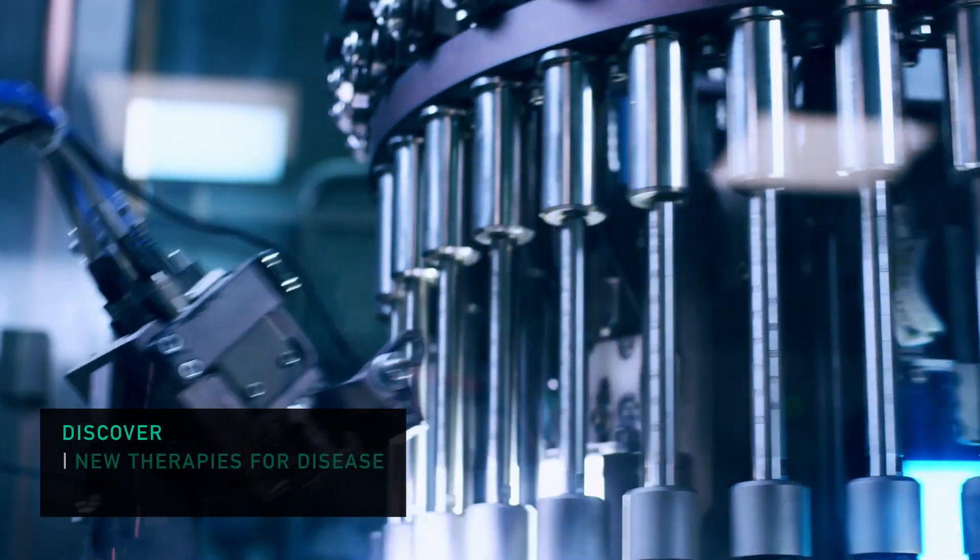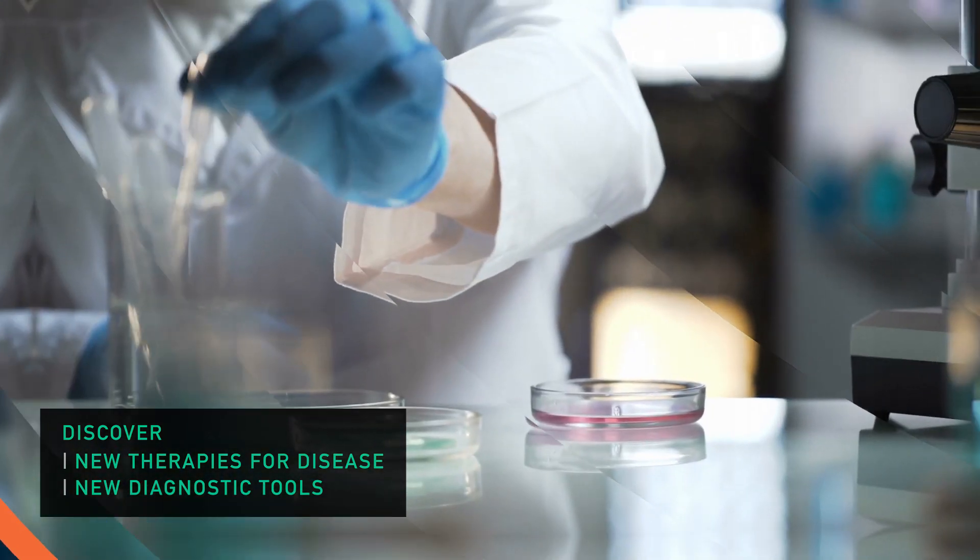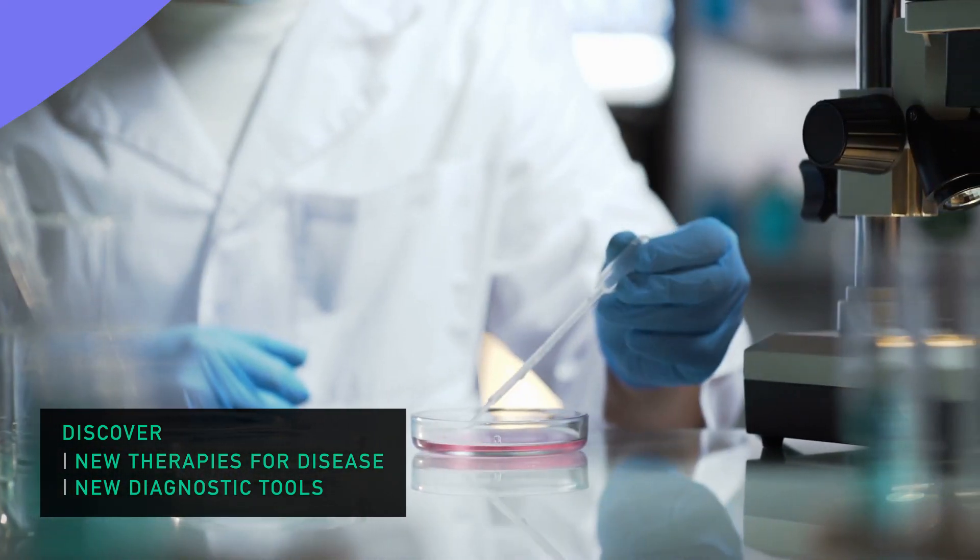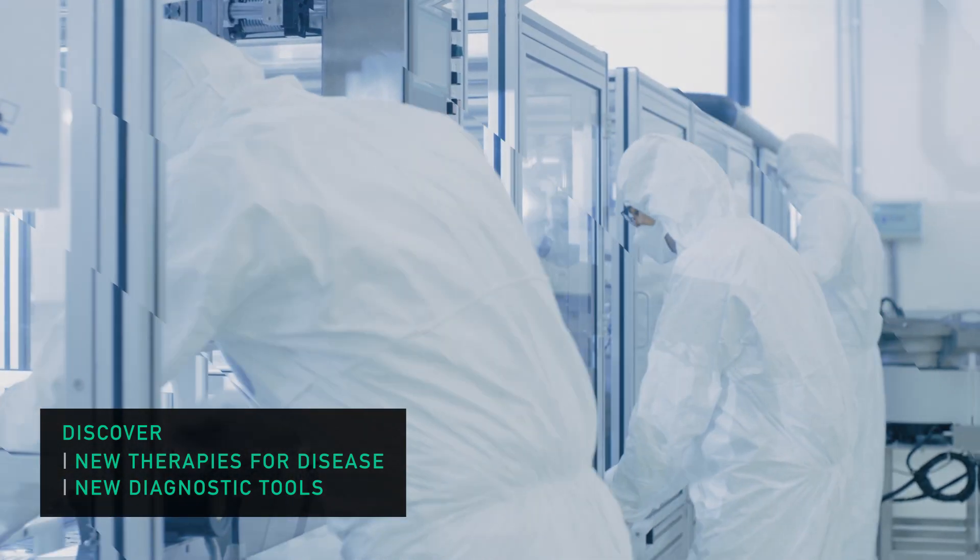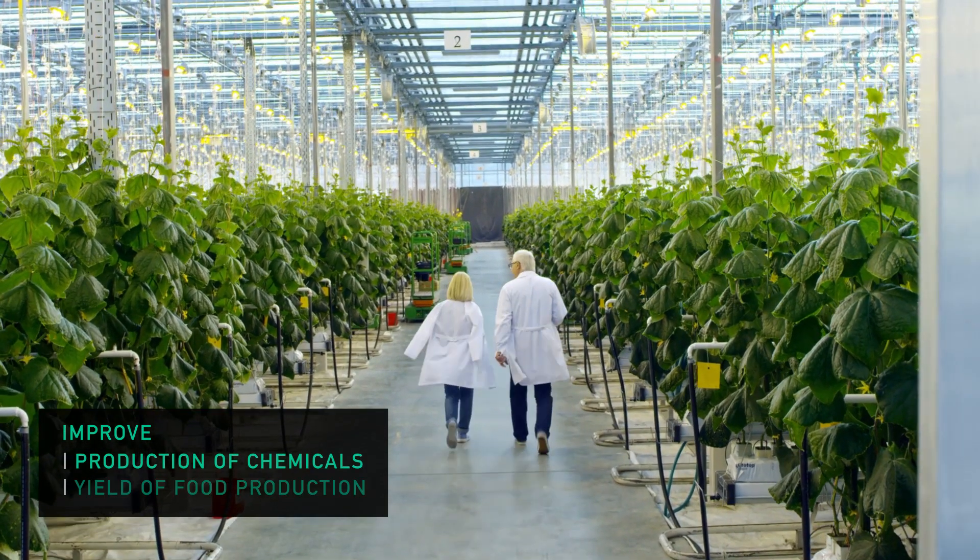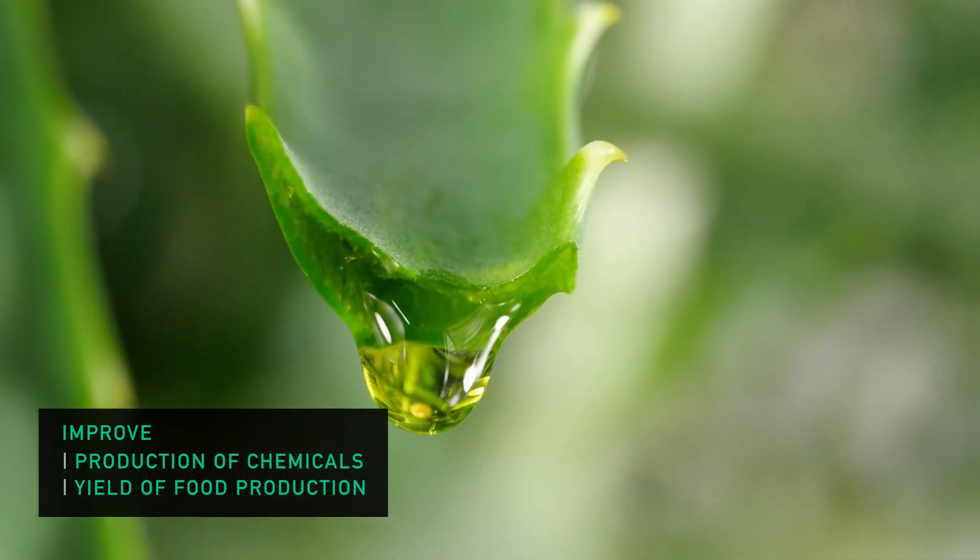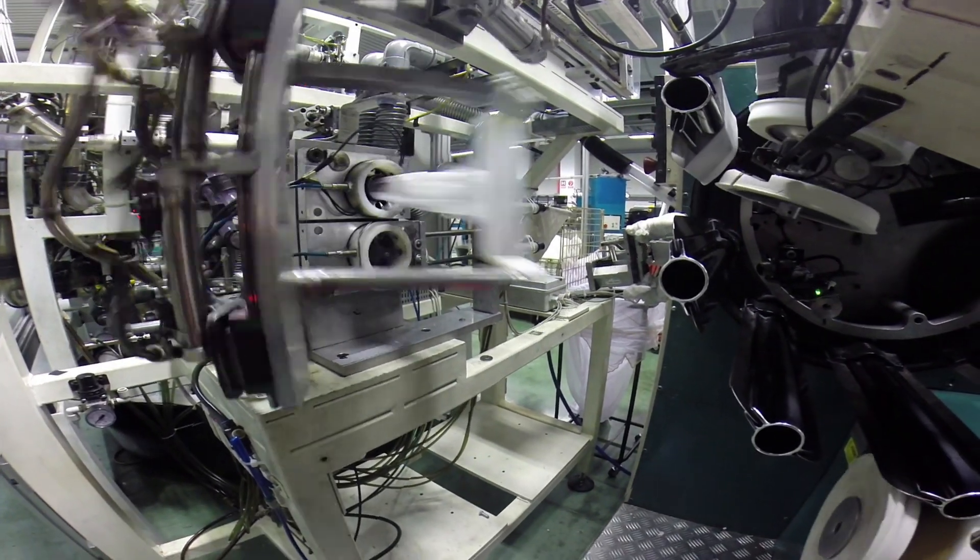Our ultra-high throughput technology enables the discovery of targeted therapies and diagnostic tools, self-fertilizing plants, sustainable chemicals, and biomaterials.